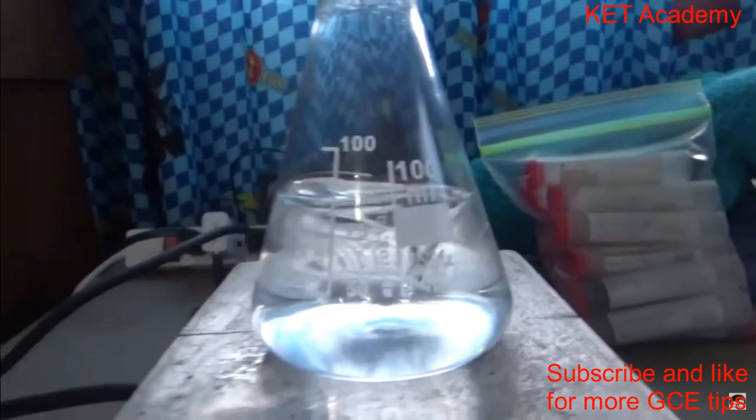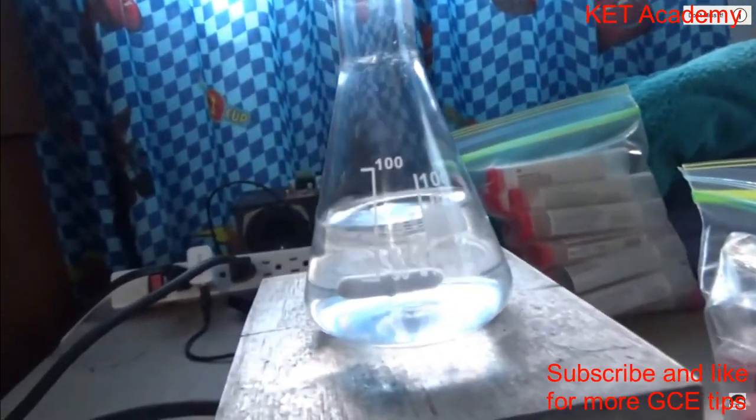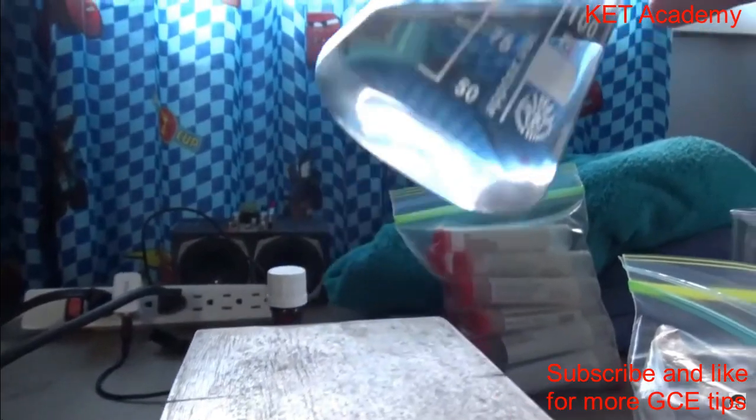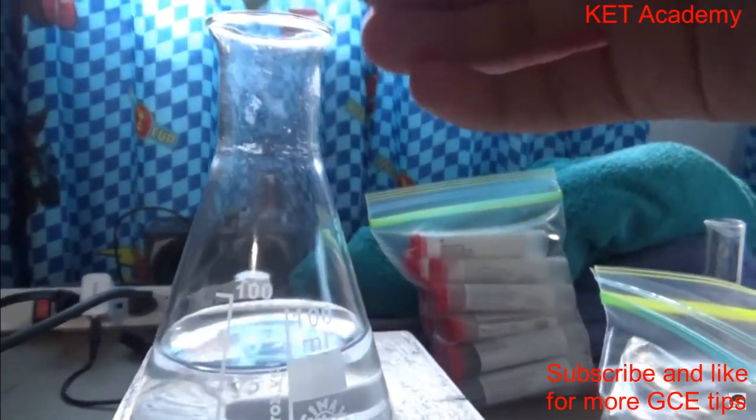Okay. Looks like it all dissolved just fine. I'm gonna stick the pH paper in again, and we'll see what we got. The other side this time. Oh, look at that. That is a bit darker, isn't it?